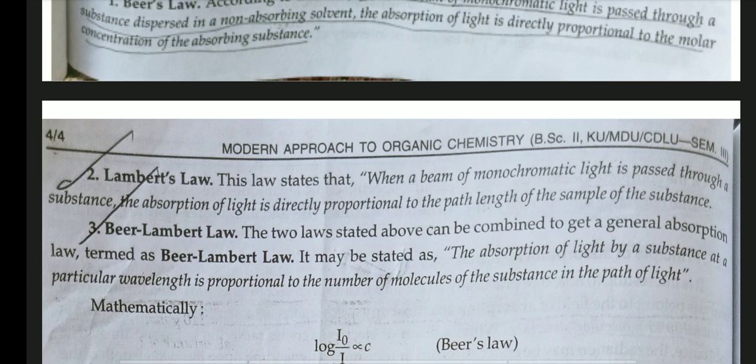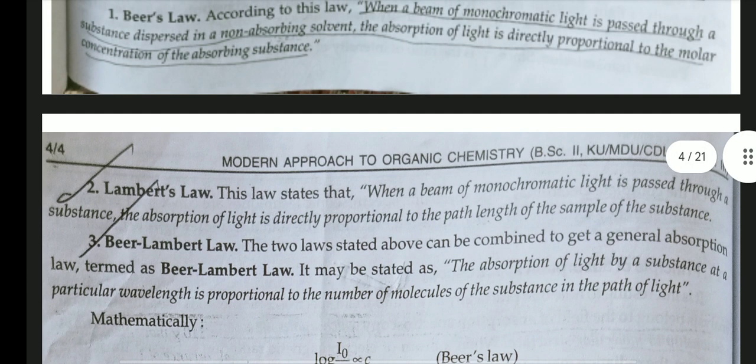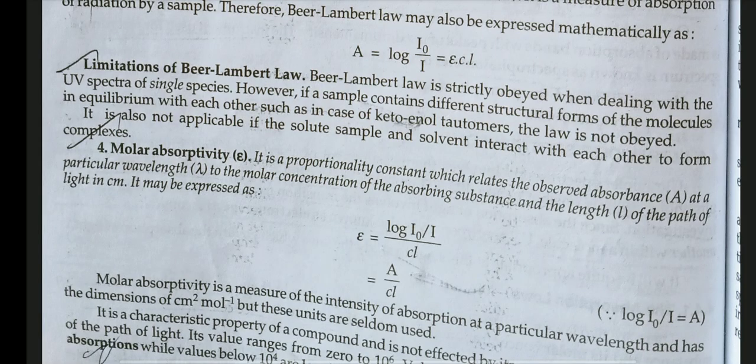Beer-Lambert's law. The two laws stated above can be combined to get a general absorption law termed Beer-Lambert's law. It may be stated as: the absorption of light by a substance at a particular wavelength is proportional to the number of molecules of the substance in the path of light. Therefore, Beer-Lambert's law may also be expressed mathematically as A = log I0/I = ECL. Limitation of Beer-Lambert's law.